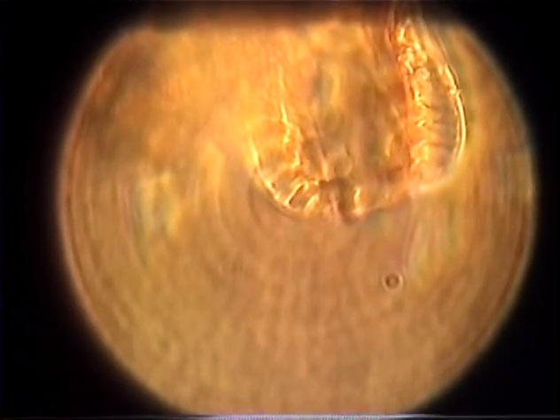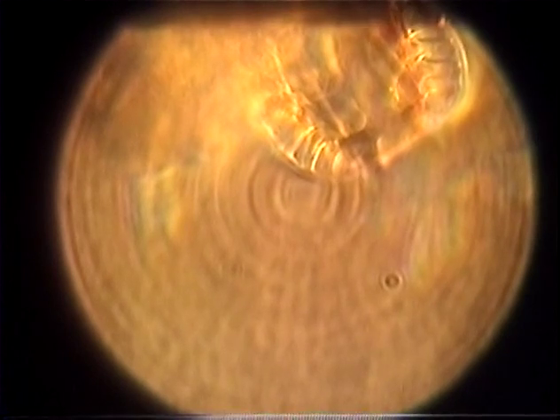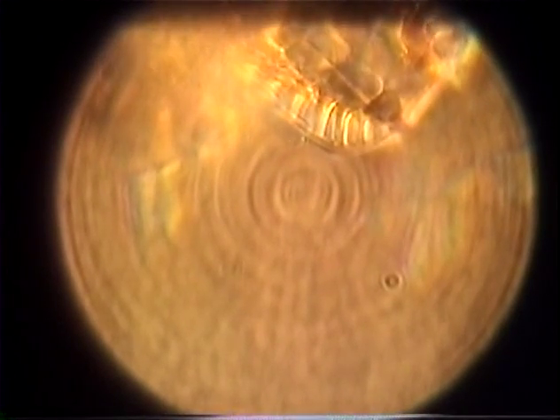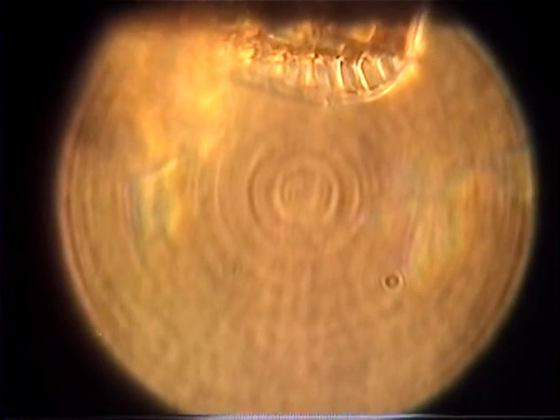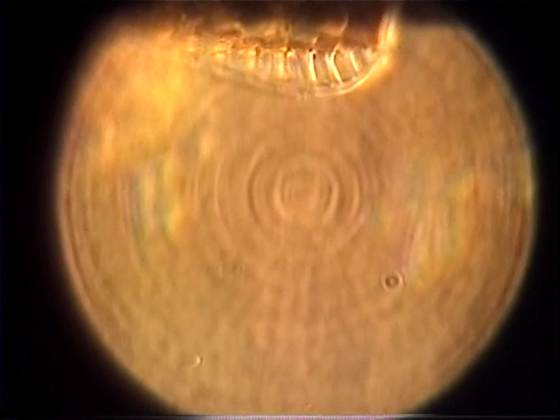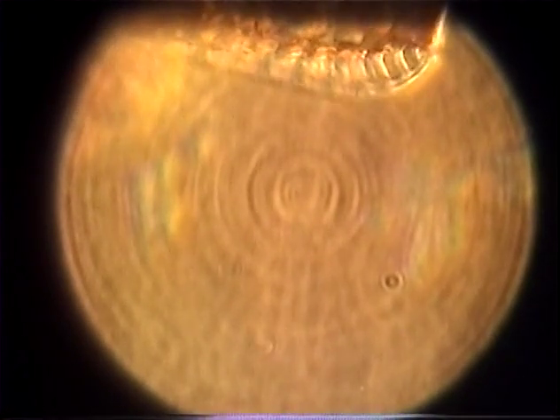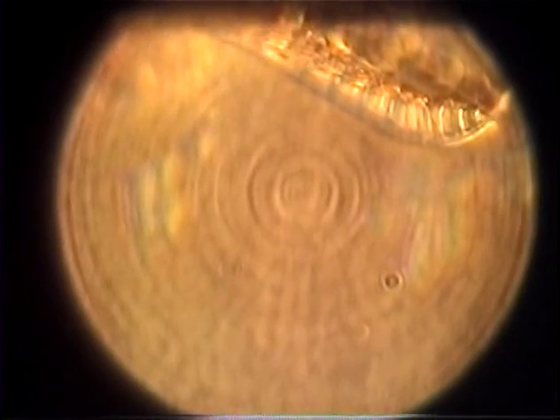I want you to remember, guys, this is just in one little drop of water. Chamberlain, Colleen, this was just in a few drops of water. We've seen several species. When you go out and you look at that lake the next time, think about the vast amount of life that's in that lake. Okay? Now, then think about the ocean, which is almost infinite. That is a very good observation.